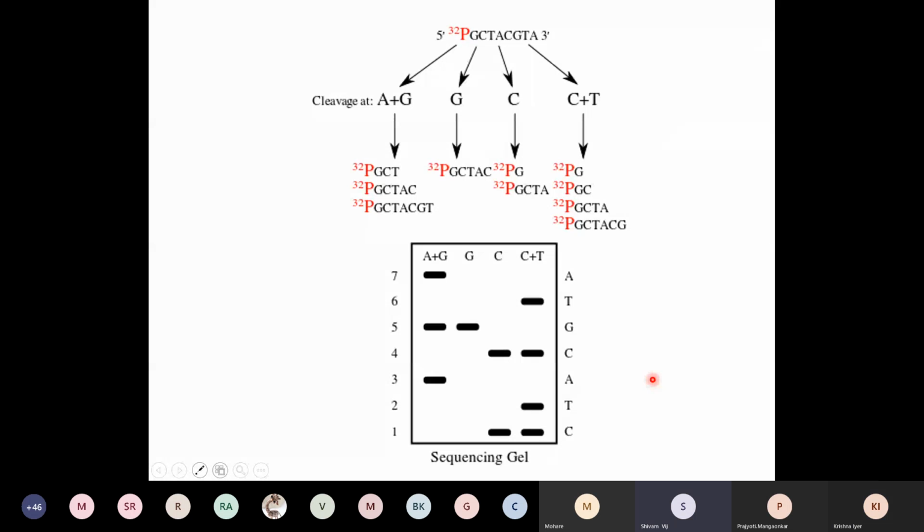My question was, when we are starting from C, we are giving the name to the segments, right? Like we are counting C and C plus T. So if it is present in both, then we are giving it the name of C. Correct. But then it's a G, right? Meaning the fragment in this is G, right?